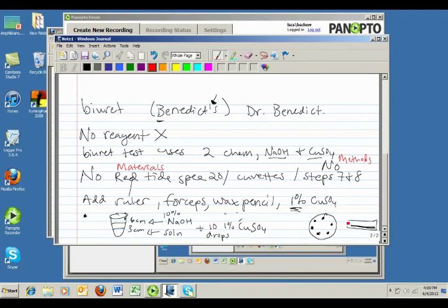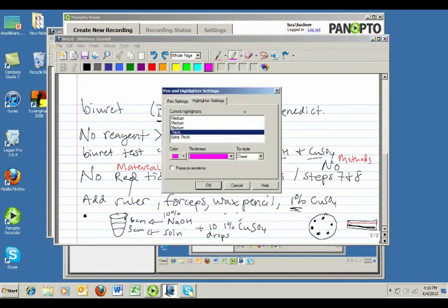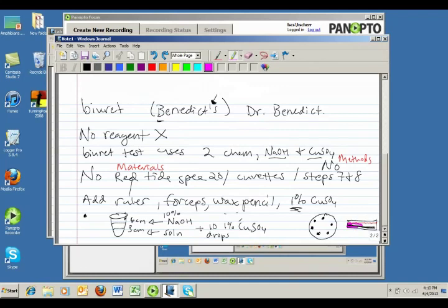And the dish will have Sudan-3 stain in it, which will be red, and it will cover the filter paper. Well, this is not really, but you understand what I mean. Then you'll leave the filter paper in the solution for a little while. Then you'll use the forceps to take it out.